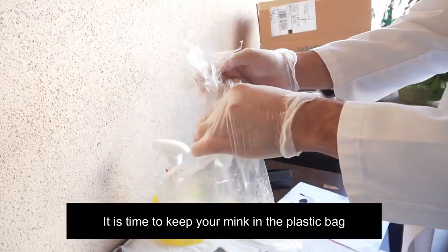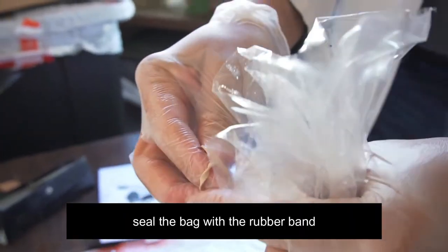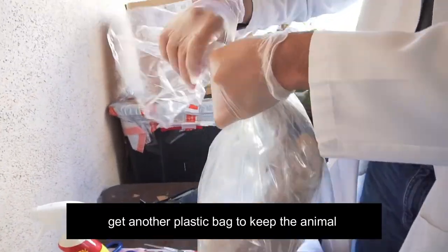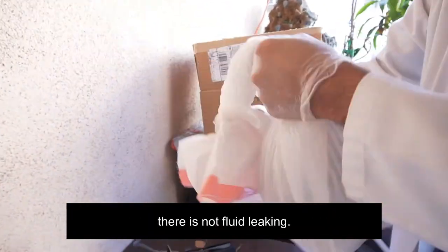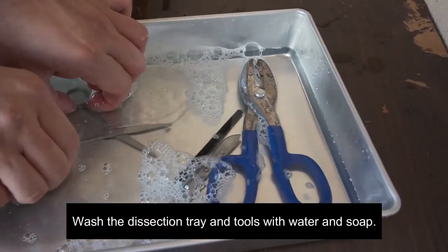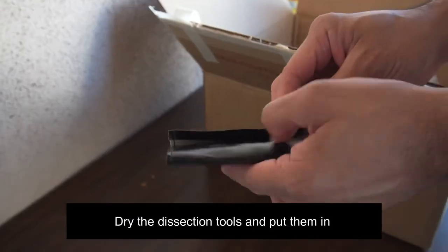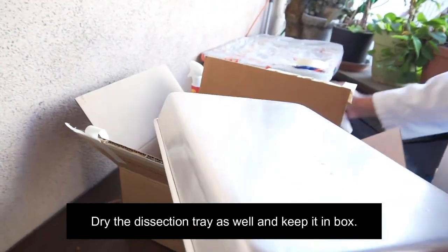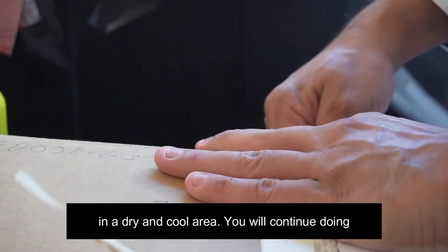It is time to keep your mink in the plastic bag where you saved the animal fluid. Put the animal inside the bag and seal the bag with a rubber band to prevent the fluid from leaking. Get another plastic bag to keep the animal and use another rubber band to seal that bag. My suggestion is to get a trash bag to make sure there is no fluid leaking. Now keep the mink in the box. Wash the dissection tray and tools with water and soap — be careful not to cut or harm yourself. Dry the dissection tools and put them in the protection case. Keep that case in the box. Dry the dissection tray as well and keep it in the box. Seal the box with tape and keep the box outside your house or apartment in a dry and cool area.